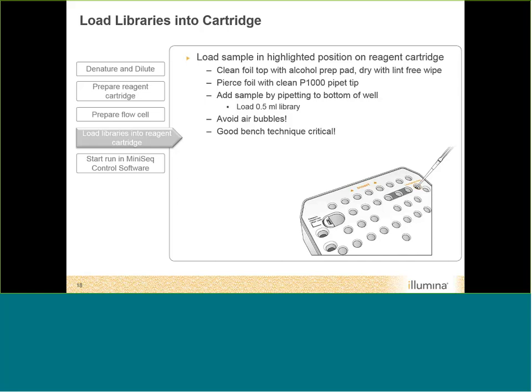With your denatured and diluted libraries ready, load your sample at the highlighted position on the reagent cartridge. All wells are sealed with a foil — clean the load library area with an alcohol prep pad and dry it thoroughly. Pre-pierce the foil with a P-1000 pipette tip, then use a P-1000 tip to load your half milliliter of prepared library. Good bench technique is critical — do not introduce air or bubbles. Visually inspect the bottom to confirm no bubbles are trapped and all reagent is delivered to the bottom of the reagent position.